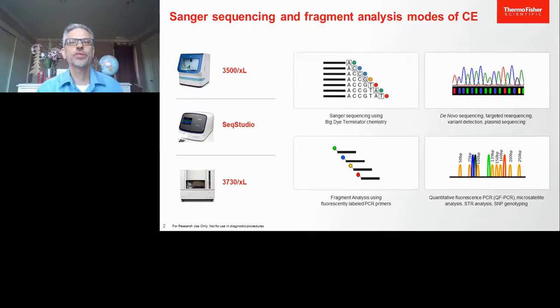During today's presentation, I'll discuss how Sanger sequencing and fragment analysis can be used in the study of SARS-CoV-2. And I'll talk about various published articles as well as in-house work during the presentation, and give acknowledgement where appropriate via citation to the authors of those articles.